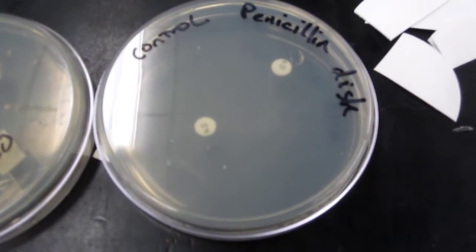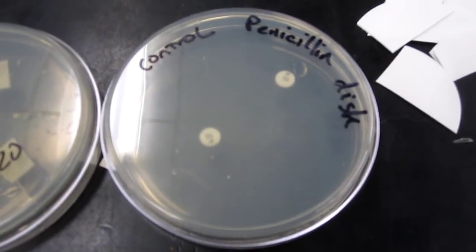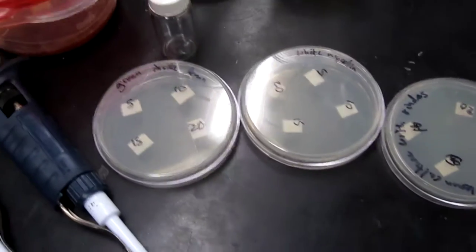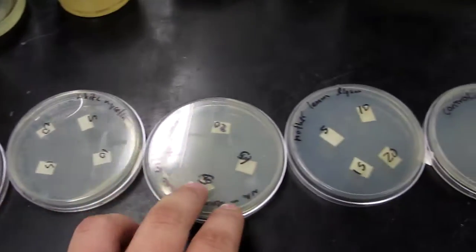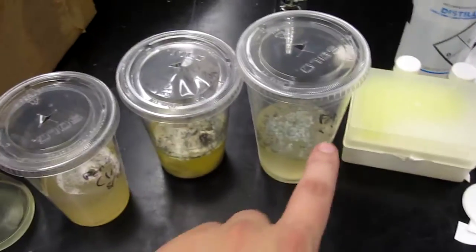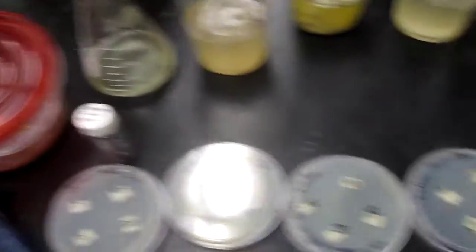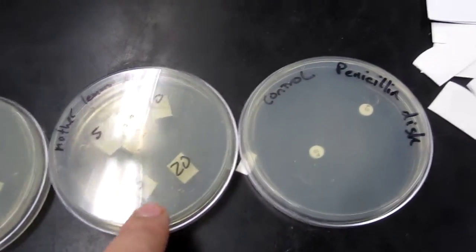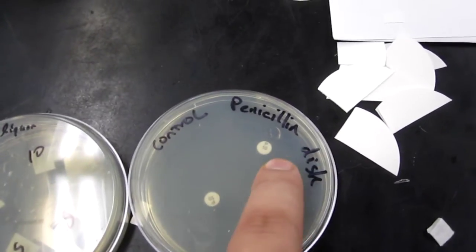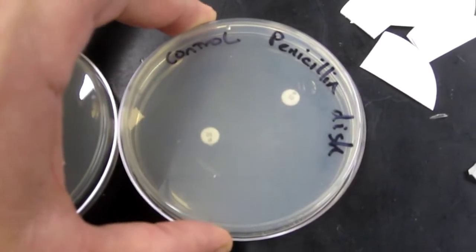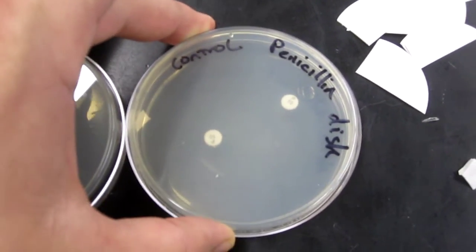All these plates are plated with Bacillus subtilis, a gram-positive bacteria that responds to penicillin, so we'll see if any of these three experimental dishes, one of each of these cultures, and one of this mother liquor, will have any comparable rings of inhibition to these 10-unit official penicillin filter papers, which is the control.